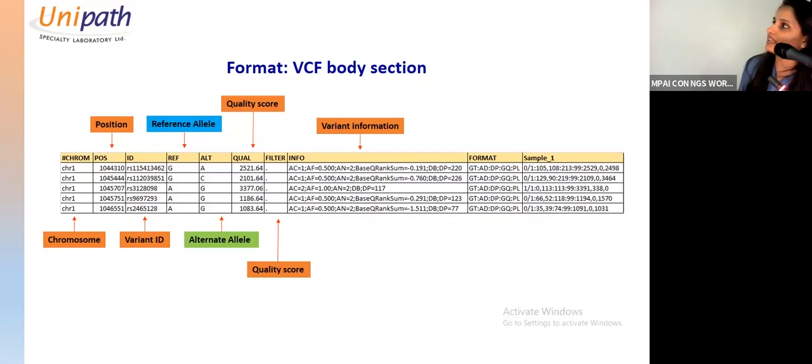Then what is in the reference, what is in the alternate, right? So here, when you say GT is genotype, when you say 0/1, it's like heterozygous. How heterozygous? Then it will have reference and alternate counts, which means that the variant which is called has the support of how many reads? 213 reads.